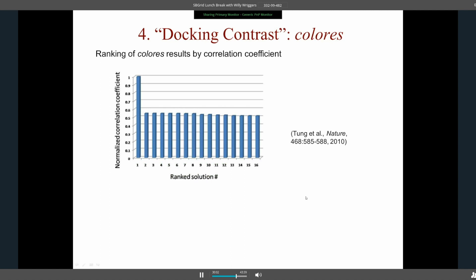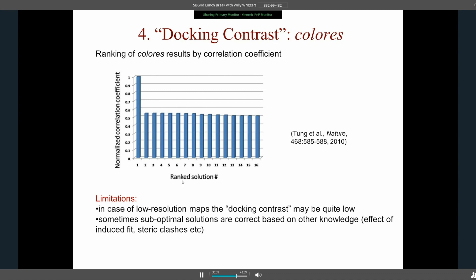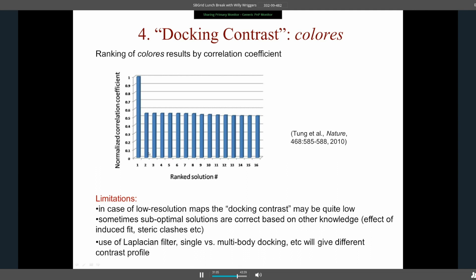Van Petegem found the docking contrast particularly useful — plotting the normalized cross-correlation coefficient among ranked Colores solutions. When the highest result is much better than subsequent ones, that is a strong indication. However, with very low resolution maps, docking contrast may be quite low. Also with fine orientation sampling, contrast between solutions may be diminished. In induced-fit conformational change cases, a second or third ranked solution might actually be the accurate one, so docking contrast needs supporting knowledge and is not 100% reliable.